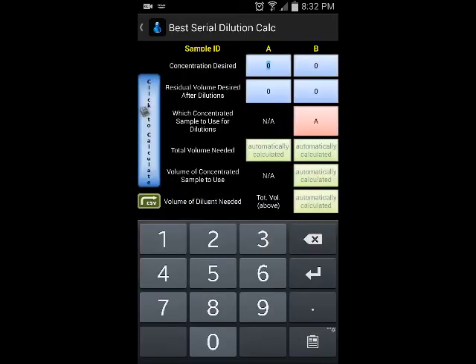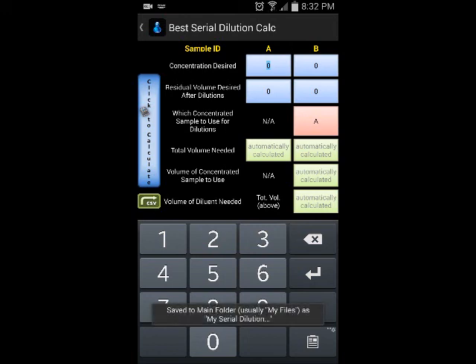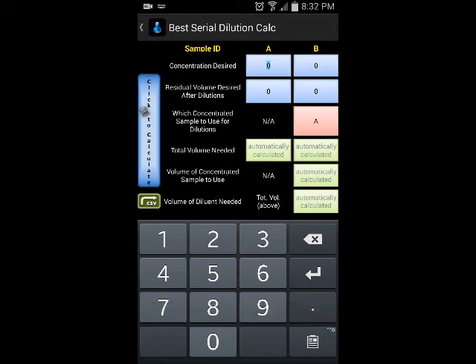The next one is my app that's already on the market, but I've added something very useful: the ability to export to a spreadsheet. That's the .csv button on the bottom left. It saves to My Files, which is the highest directory on Android devices. If yours happens to be named something differently, it'll still save to the highest directory regardless of the name.